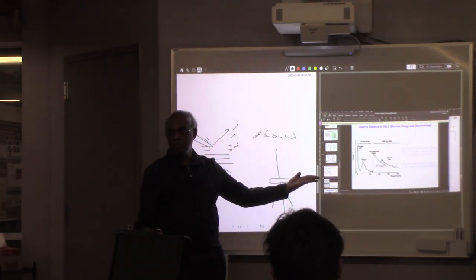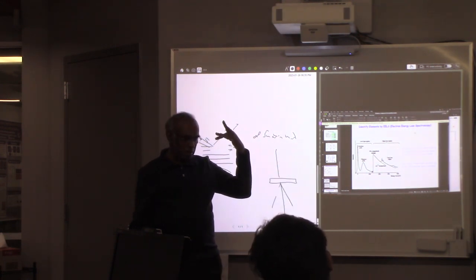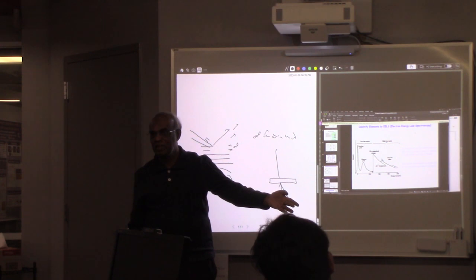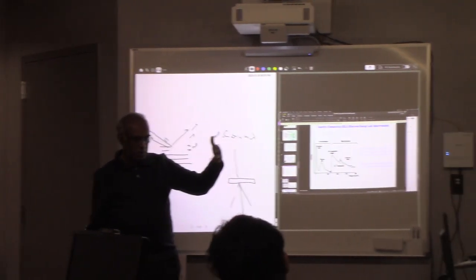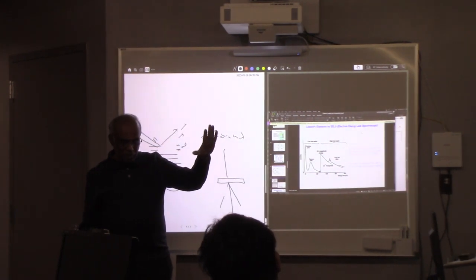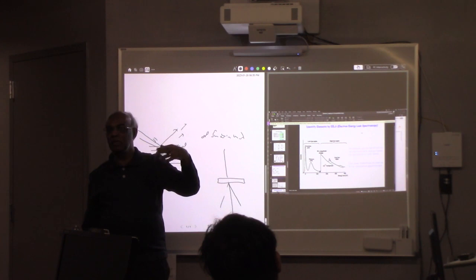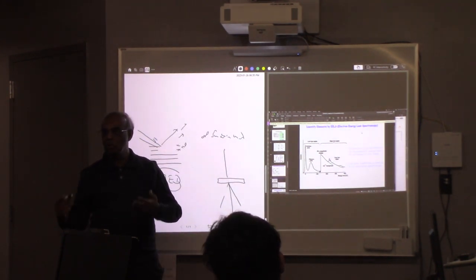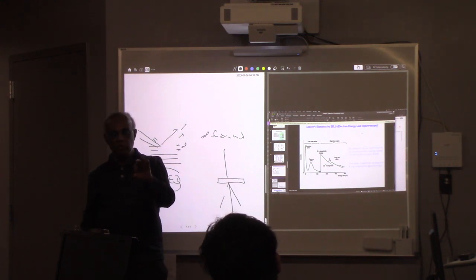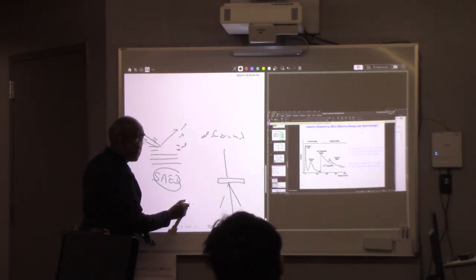To the scattered electrons. Yeah, it can maybe excite some phonons, right? Or it can maybe emit some electrons from other atoms, so some core electrons. So you can see a lot of them. Also, if you have a metallic sample, you have a lot of free electrons, right?